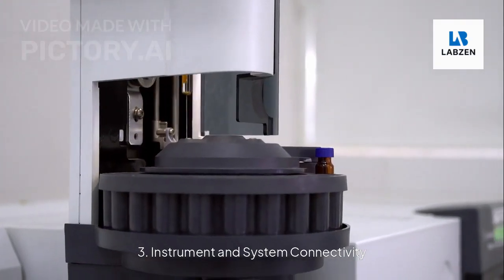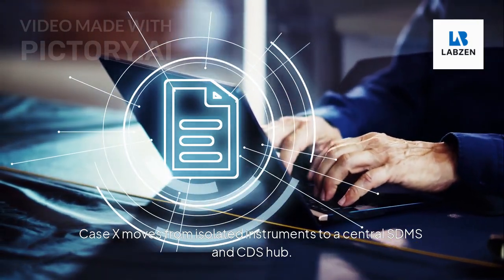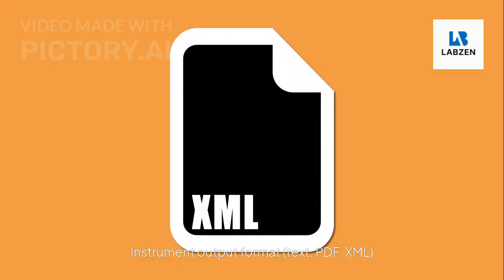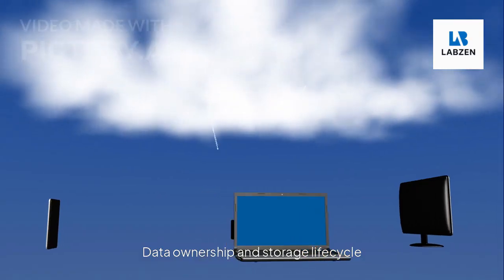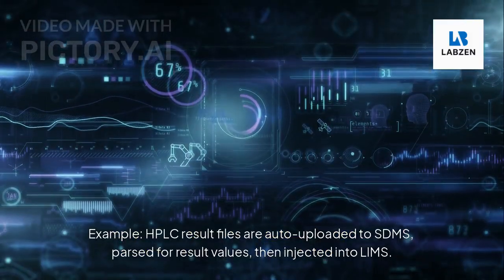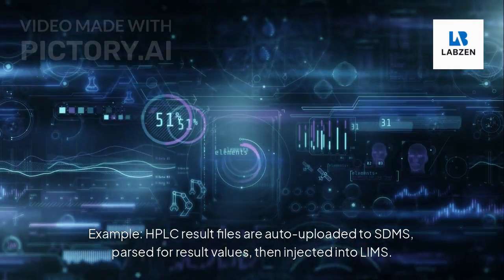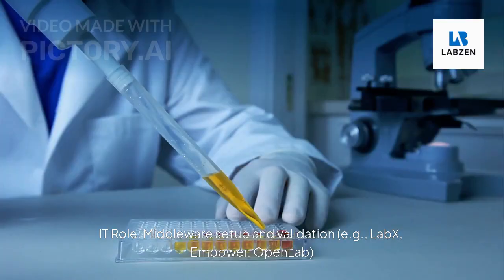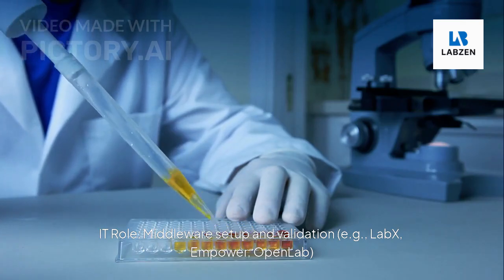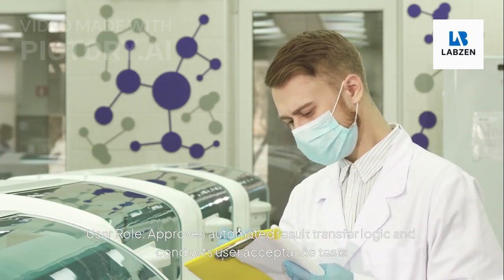3. Instrument and system connectivity. Case X moves from isolated instruments to a central SDMS and CDS hub. All critical devices are mapped for instrument output format (text, PDF, XML), data ownership, and storage. Lifecycle integration triggers: manual, automated. Example: HPLC result files are auto-uploaded to SDMS, parsed for result values, then injected into LIMS. IT role: middleware setup and validation, e.g., LabX, Empower, OpenLab. User role: approves automated result transfer logic and conducts user acceptance tests.